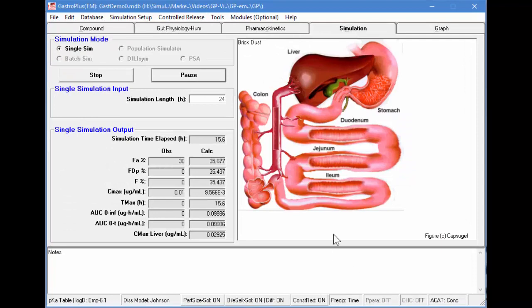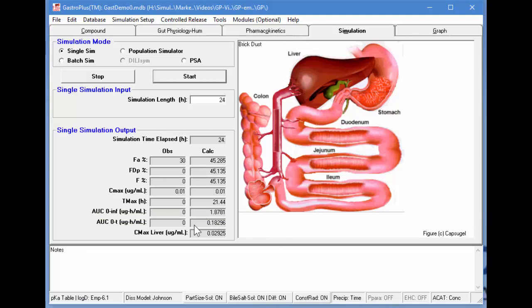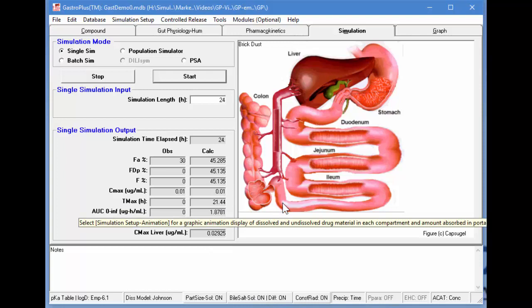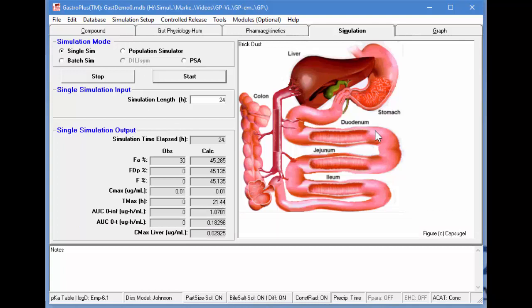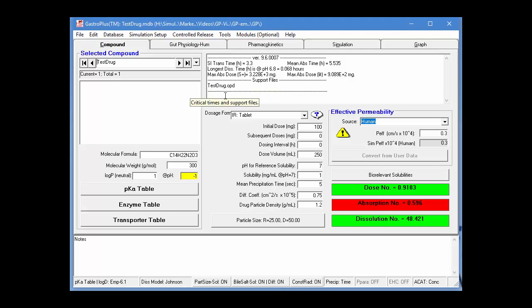Let's perform a simulation with the new dose and look at the results. With the higher initial dose, we have a lower fraction absorbed — that's normal for a low-solubility compound. The Cmax is 0.01 or 10 nanograms per milliliter, which is exactly what we wanted to achieve. So, in order to achieve this Cmax, you would need to increase the dose to 48 milligrams. For the second example, I'm going to optimize the absorption scale coefficients to better fit the observed data. The database called testdrug has been copied to a local directory, along with the OPD file containing the experimental values.